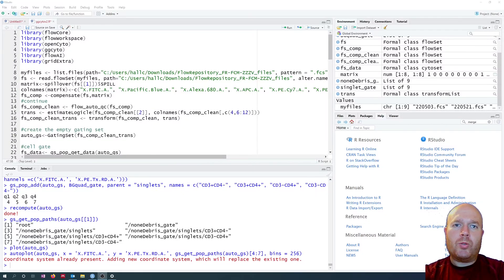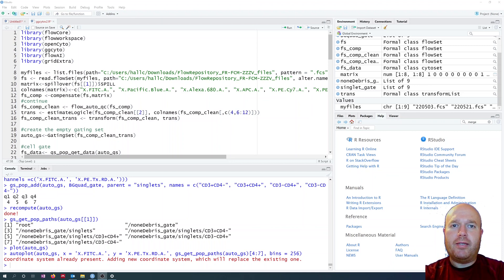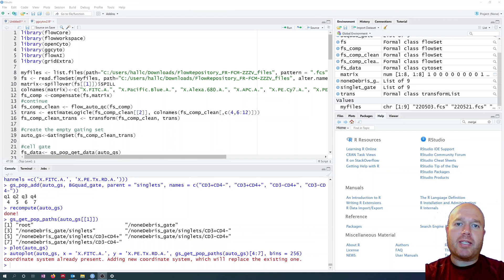Hello and welcome to this short introduction on how to analyze your flow cytometry data in R. This episode is about ggcyto, which is used to visualize your flow cytometry data. Previously we've looked at using autoplot and some quick plotting tools, but now we'll have a look at how we can have more control over the visualization.